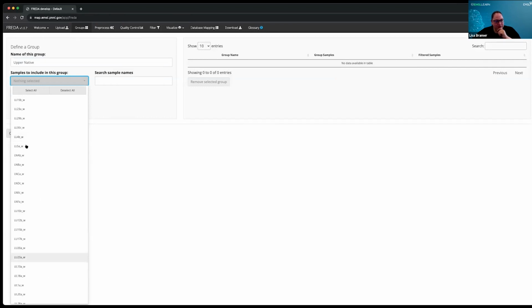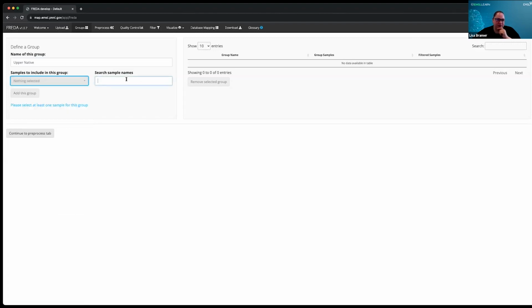And if I go down here to look at my list of samples, you can see I have all 36 samples listed here. That would be pretty tough to just go through and hand check each one that I want included. So if you name your samples in an intelligible way, I can go in and search. And I happen to know that everything that I'm interested in has a UN in the sample name, for upper native. When I do that and then click on my samples to include, you can see it's just searching and finding those sample names. I can select all of those samples and add a group of samples I'm interested in, that pops up over on the right.